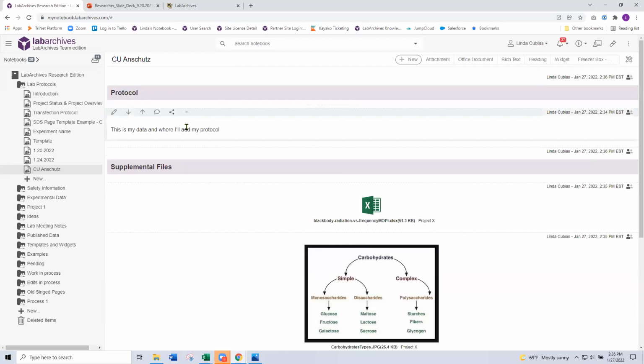So this will help give your page some order. It's also what you would create a page template using. Page template's going to basically have some headers, and you've organized, and some placeholders for the different data and the type of data you want to upload to the page. Even the heading has a name, date, and timestamp. It's all a trackable part of your notebook.